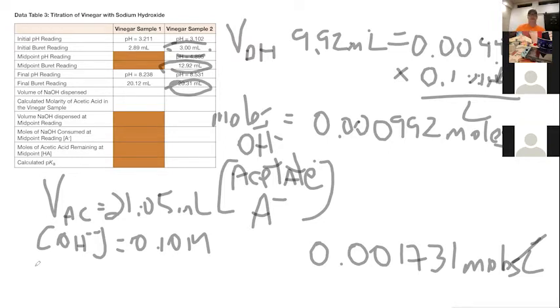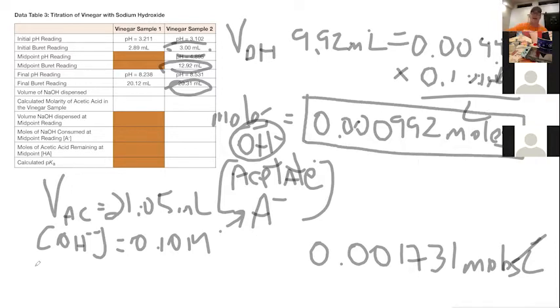So basically, what we're doing is we're converting a strong base into a weak one. That's why the pH only goes up slowly, because we take a very strong base and we're converting it into a very weak base. So a weak base doesn't really change the pH very much. But when all the weak base is basically used up, then we have more strong base than weak base and our pH rockets up.